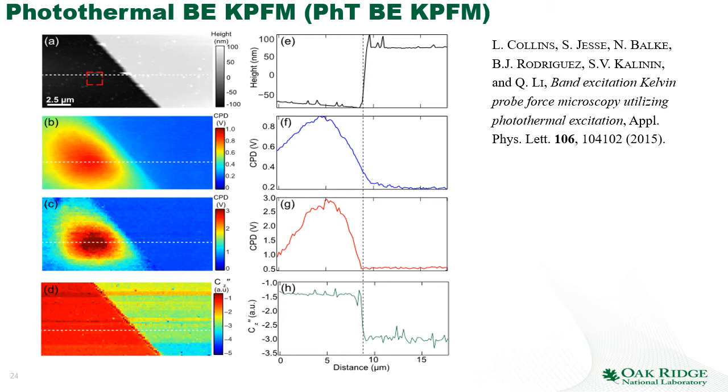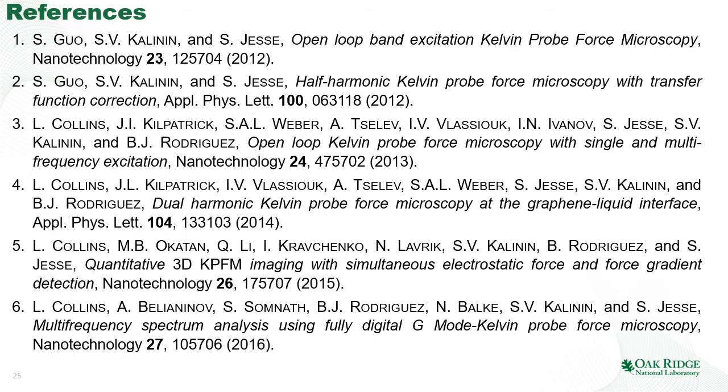same samples. So we have silicon and gold. We have the classical KPFM image, so again we deposited some charge here and it kind of diffused. We have a photothermal image. In this case, we measure the signal with the higher localization because we measure the force gradient rather than forces, so there is a higher resolution. And in addition, we also get the detection of the capacitance, so we can clearly measure the capacitance difference between the gold and the silicon.